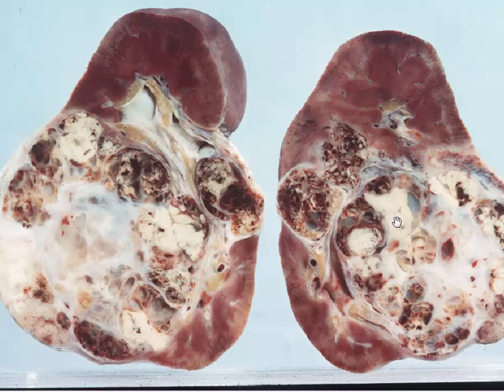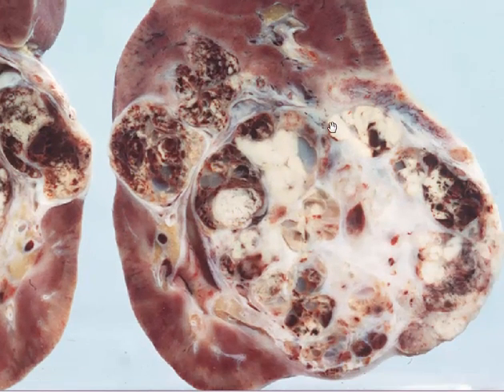Finally, you might ask yourself, well, where is the actual tumour? And the answer to that question is that the tumour is these pale, slightly yellow fleshy nodules seen most easily at the periphery of the tumour and advancing into the renal parenchyma. If you scraped these nodules with a knife, you'd find that their consistency was more like pate than anything else, and that's because these cells are very full of lipid.